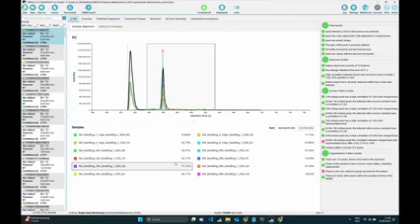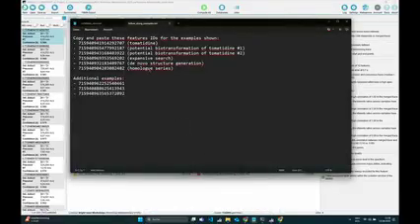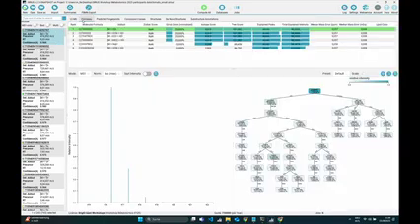But what you can also do if the sorting didn't work for you, you can just go to this follow along text file and just copy and paste the first ID into the search field, and then just search for this ID. Now we will look a little bit at the different tabs, and the first tab that you have will be the formula identification tab. I will now just show this.